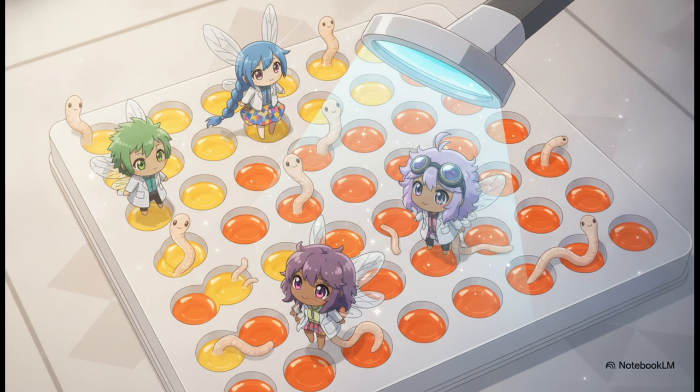It means researchers can now rapidly screen dozens, even up to 96 microscopic samples all at once. They can check the oxidative stress levels in tiny organisms, like Drosophila fruit flies or microscopic nematodes, without needing massive amounts of tissue. We can literally measure the exact efficiency of the catalase enzyme in different parts of a tiny organism's body to see exactly how it handles environmental stress.